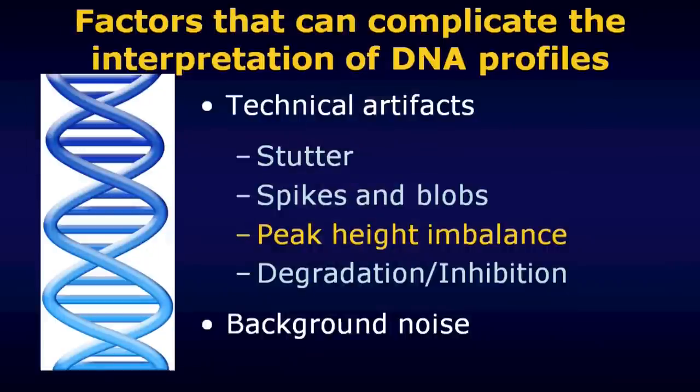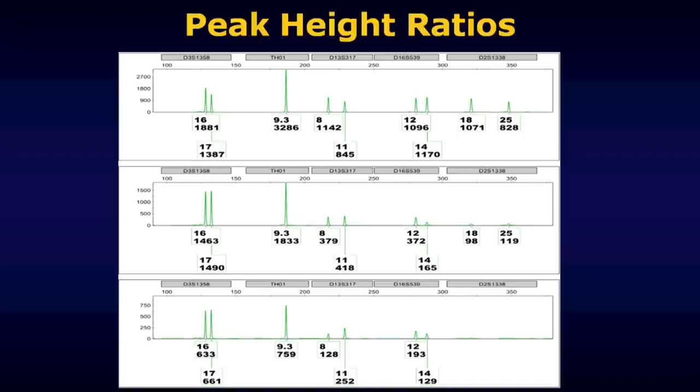Because here's a third one, this idea of peak height imbalance. Let me tell you what I mean by peak height balance before we start talking about peak height imbalance. I think it'll go a little bit more easily that way. This particular slide is showing you, once again, a fairly standard, kind of normal-looking electropherogram.